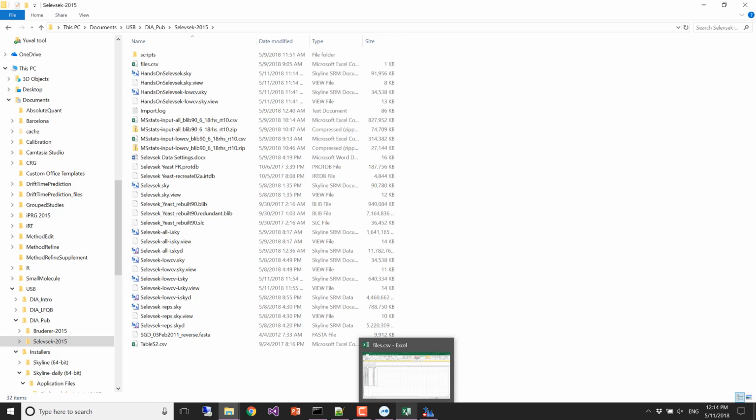So yeah, Andy Hufnagel is talking about doing a 5x5 assay where you measure your assay 5 times in a day over 5 days, and then proving your CVs of that assay. So when you're doing something that's going to become an actual clinical assay, or even just something that you might measure thousands of times, this reproducibility of measurement is extremely important, and the people who are leading that direction of investigation are pushing for more and more stringency in the things that get measured.